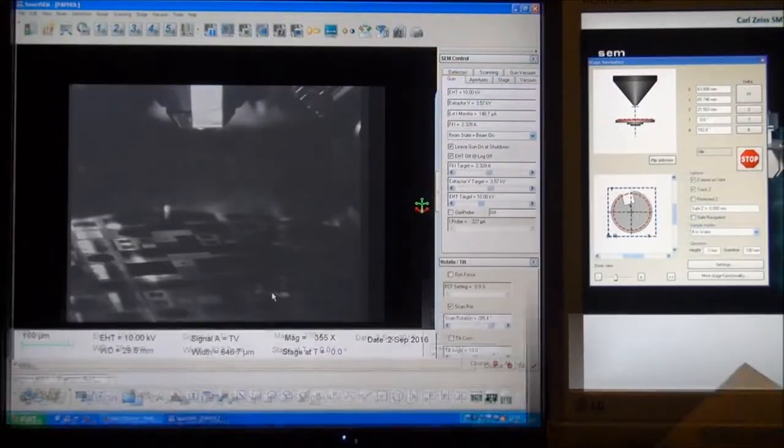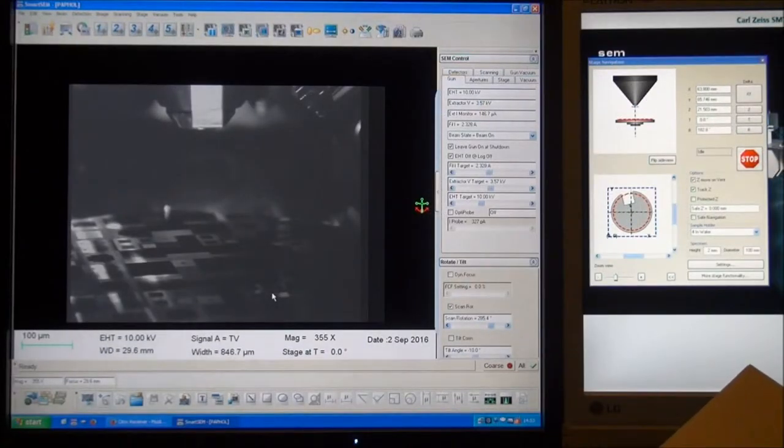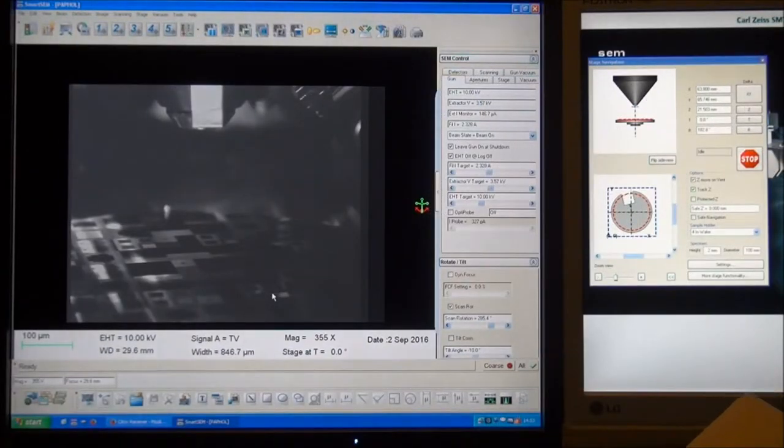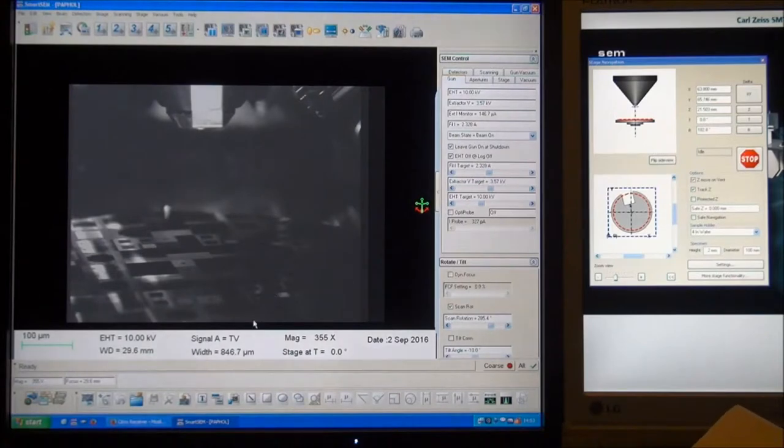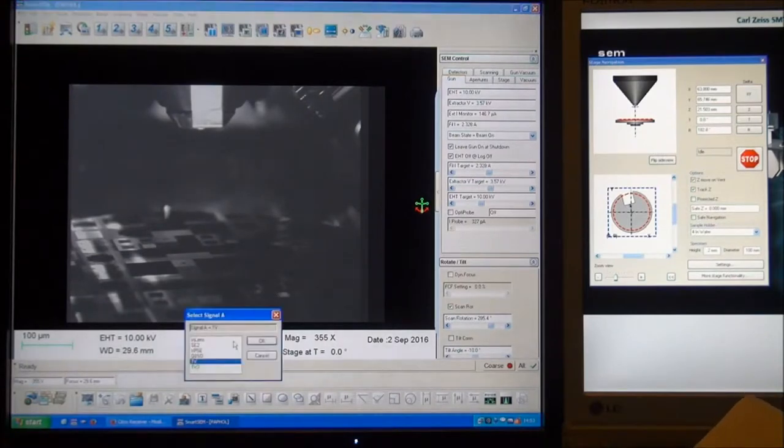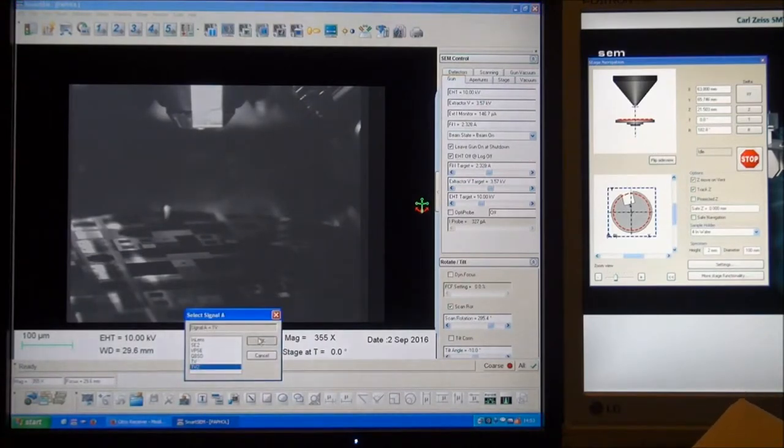And this TV signal shows the angle view which is different from TV2. Change to TV2.